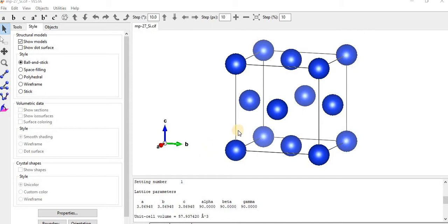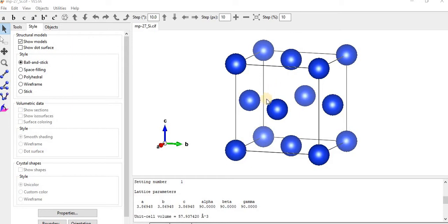So now let's see. This is the crystal structure of silicon in 3D visualization.